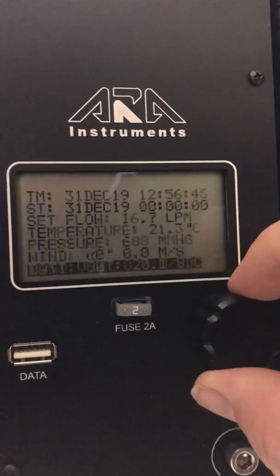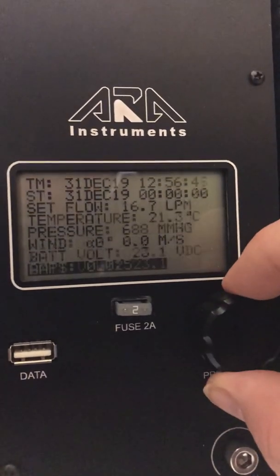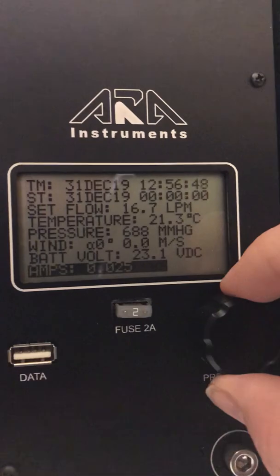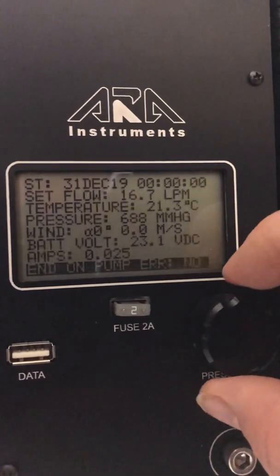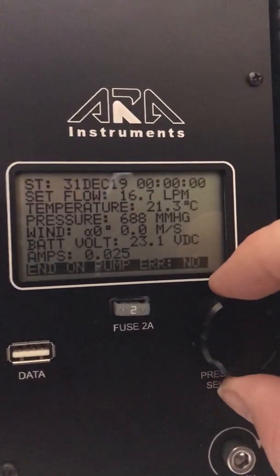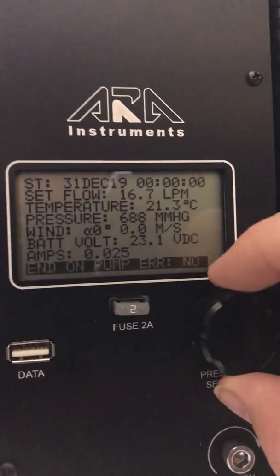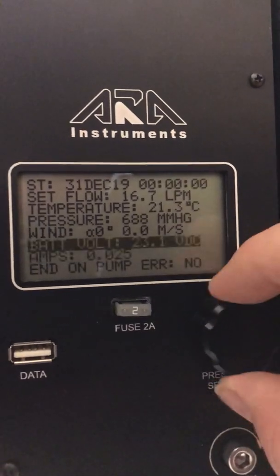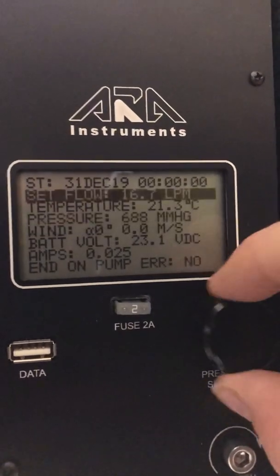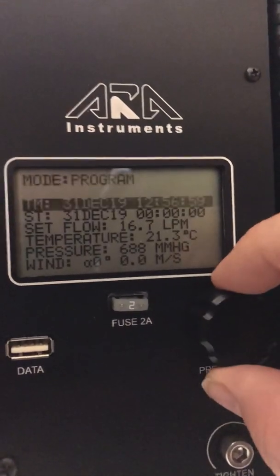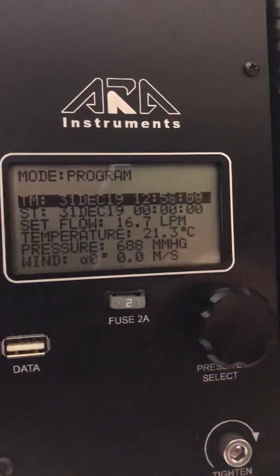Here's your flow you can set that, pressure, wind, here's your battery voltage, amps, if there's a pump error. So very simple to set up and operate.